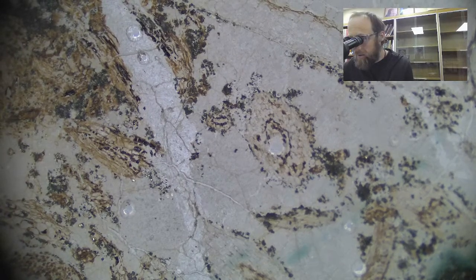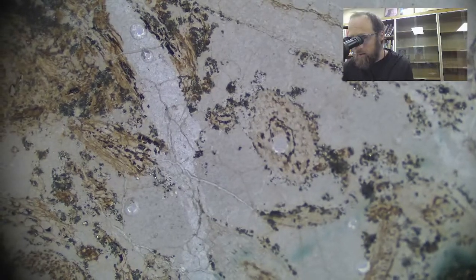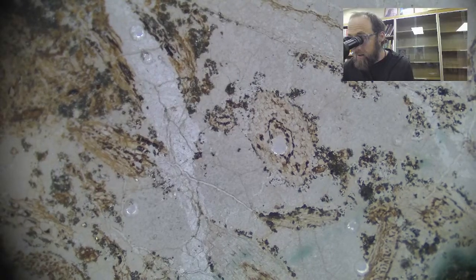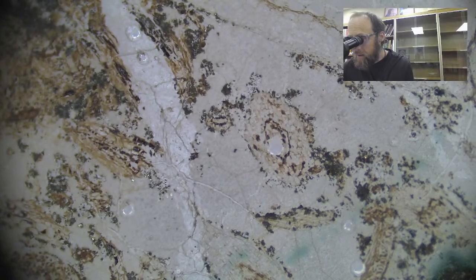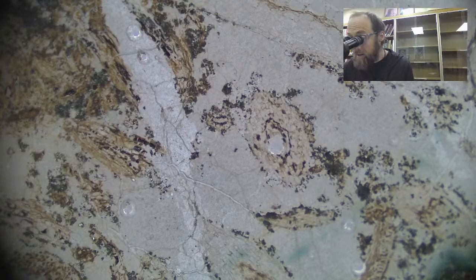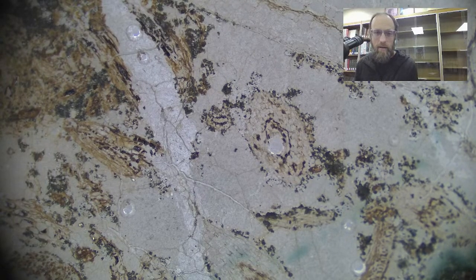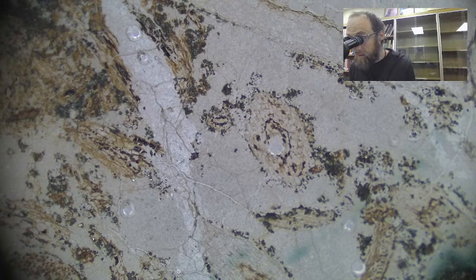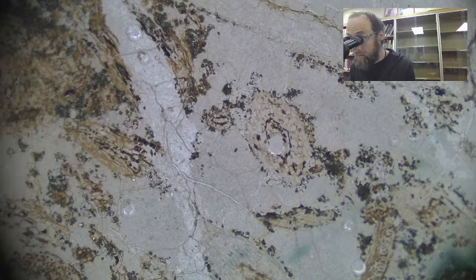I have a wider field of view looking at it through the scope, and what the eyes can see through a scope is a bit different. Even if the camera is pretty good, it'll still be nothing like viewing directly by the eye.